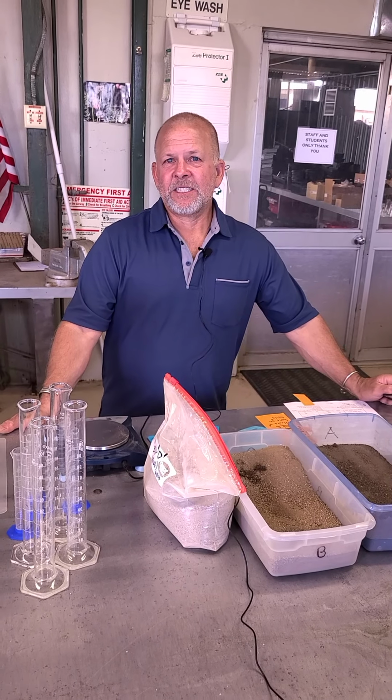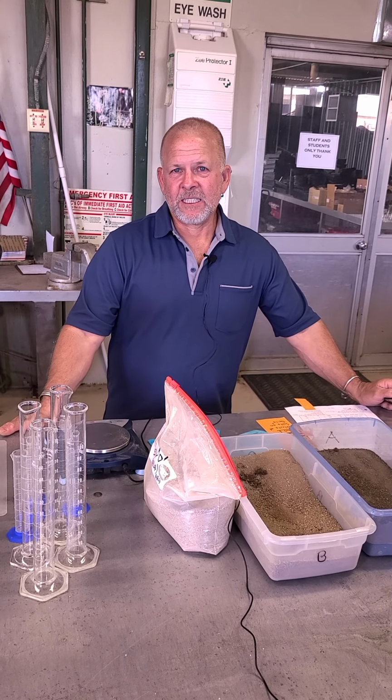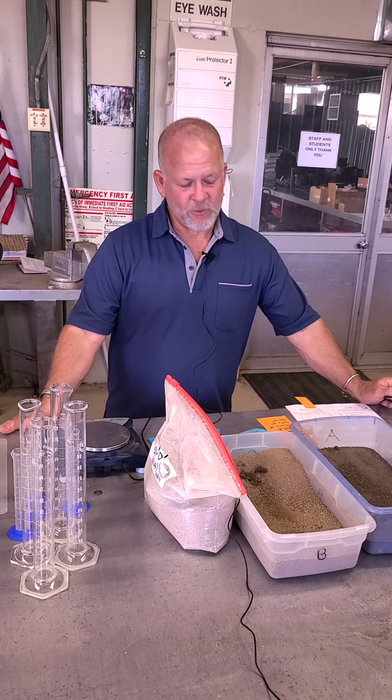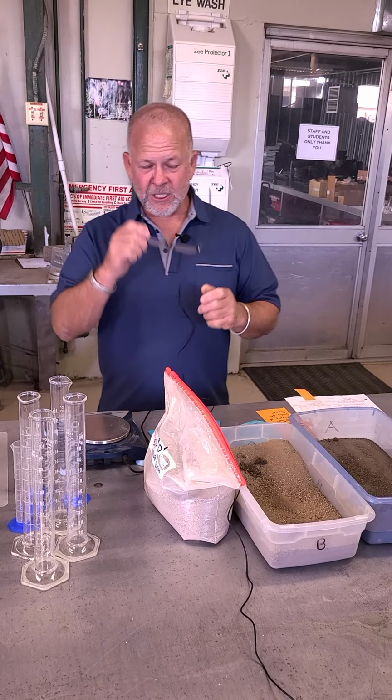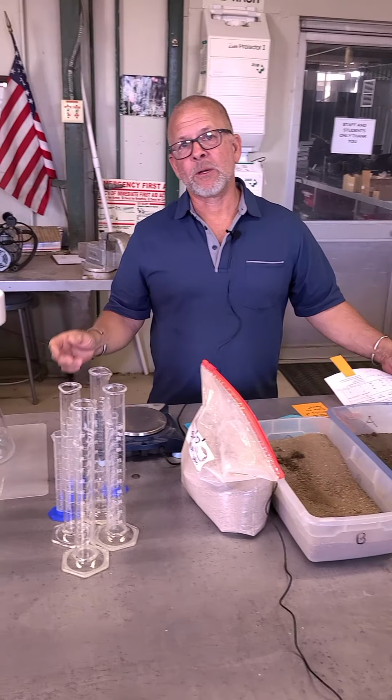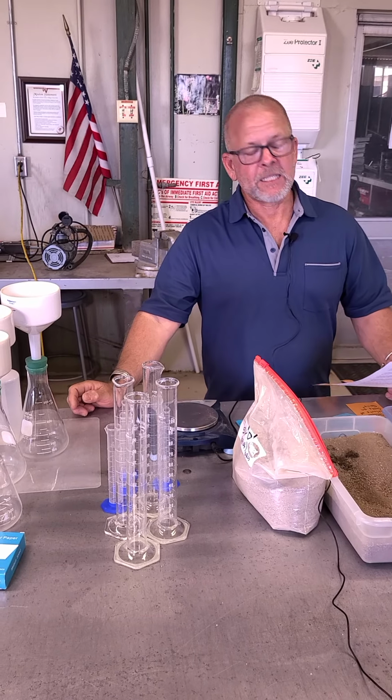Hello there, this is AGNR 131 Soil Science, and this is Laboratory 8, Exercise 1, Effects of Salts on Soils. I'm going to go ahead and read the introduction on this so you understand exactly what we're going to be doing today in this part 1.